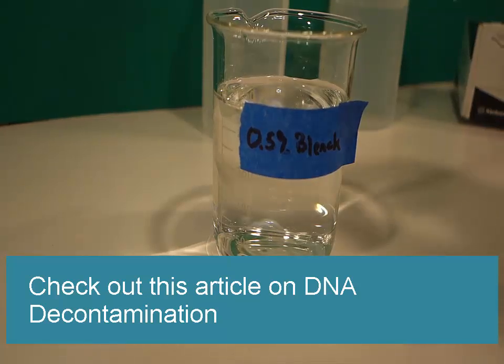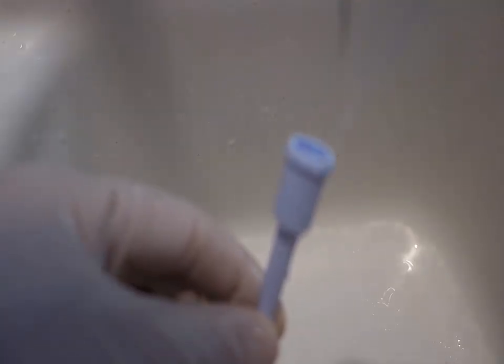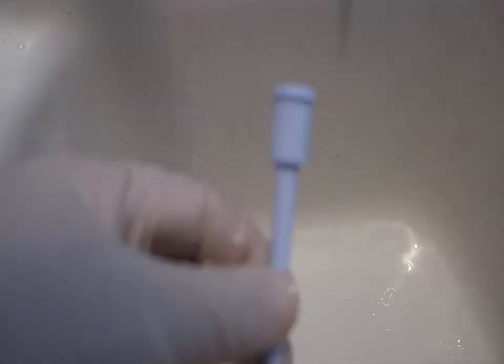If you need to decontaminate DNA, RNA, or a biohazard, immerse the barrel in 0.5% bleach for an hour. After an hour, rinse again with tap water and then with 70% isopropanol to dry out the water. Shake out the excess isopropanol.